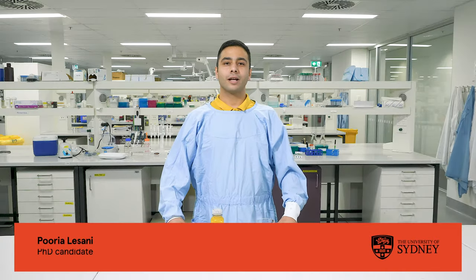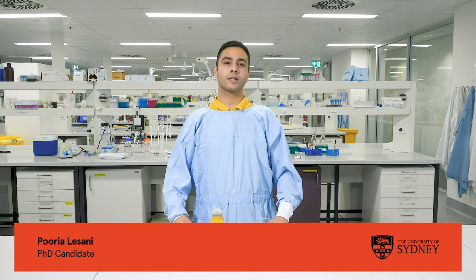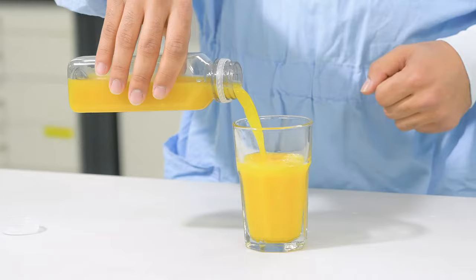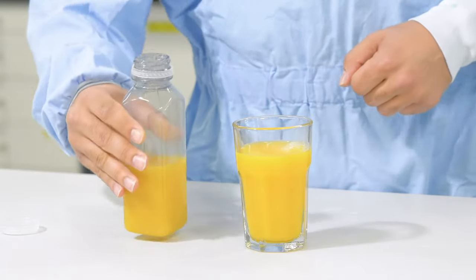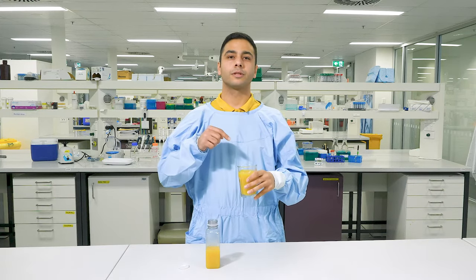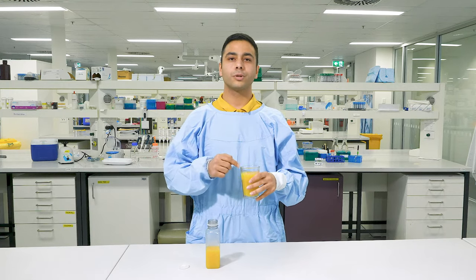Hi, my name is Puriya and today we are going to make carbon quantum dots as a novel fluorescence nanomaterial and we will use them as a biosensor. But first let's have orange juice. Oh wait, I can't drink this one in the lab, but I can extract ascorbic acid out of the orange juice and use it for making carbon quantum dots.